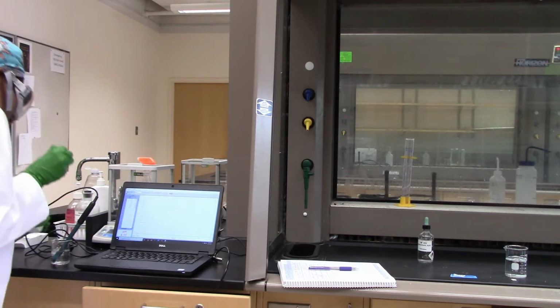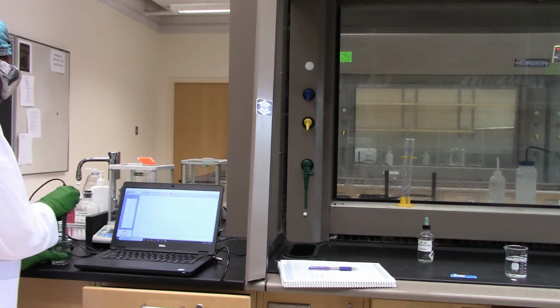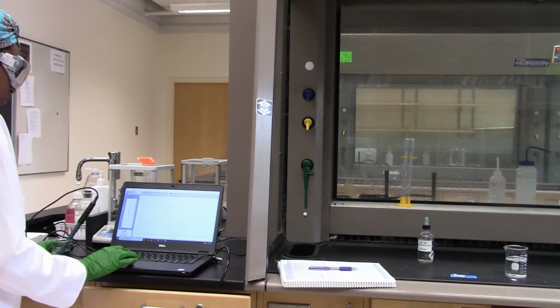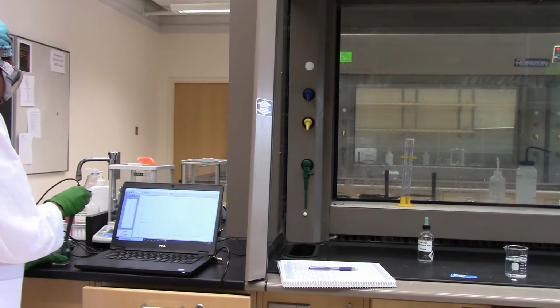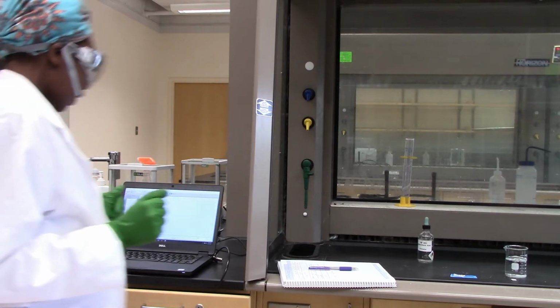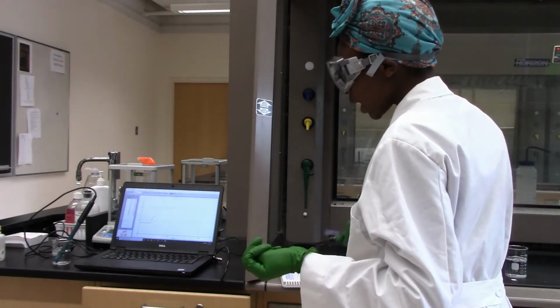Just slightly. Okay, interestingly the pH is going up to 8.